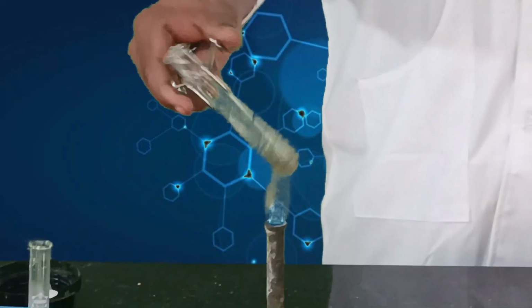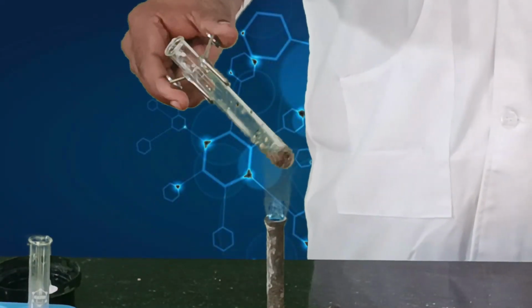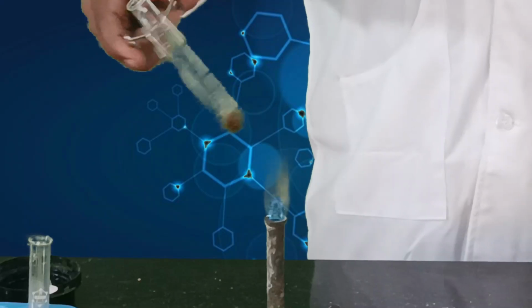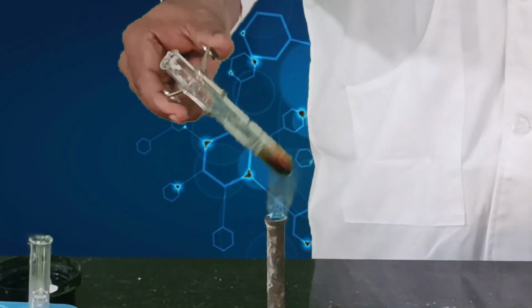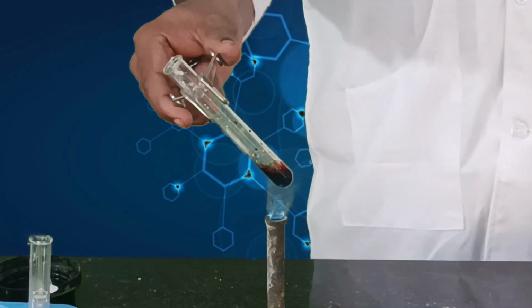Then heat the contents. The content will turn brownish or dark color.